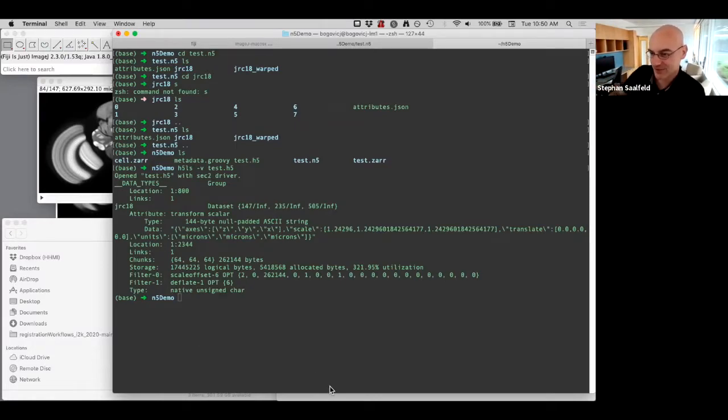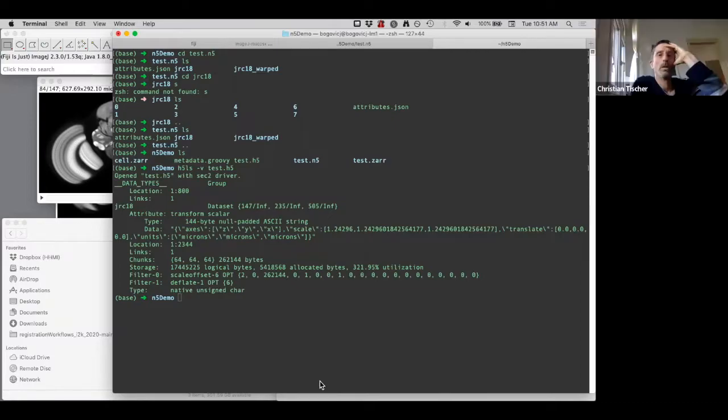If you ask for individual attributes, but I'm not sure what the situation is for "give me all of this as a giant JSON object" at this time. Oh, I see. But we will have the same problem in Zarr then, maybe, because with this already factored in, right? For these transformations both are supported.